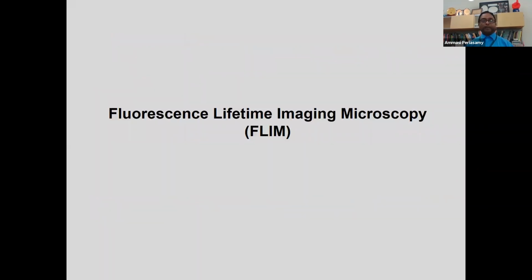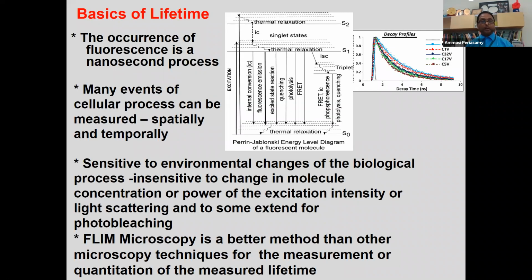So fluorescence lifetime imaging microscopy, many of you know, I don't have to go deep in the discussion, but I would like to cover a little bit. As you know, what we are measuring as lifetime is, if we illuminate with a light source, any fluorophore molecule goes to the excited state and returns back to the ground state. We are measuring the average lifetime, how long the molecule stays in the excited state.